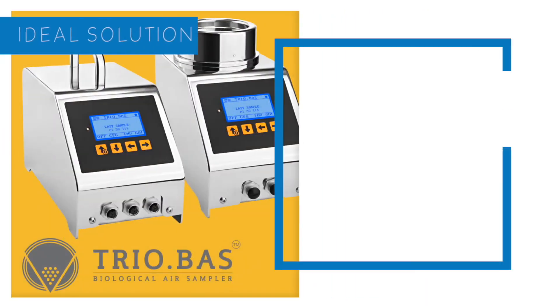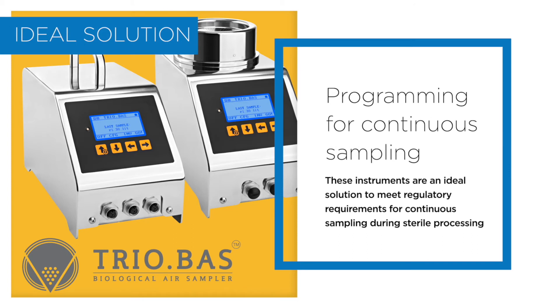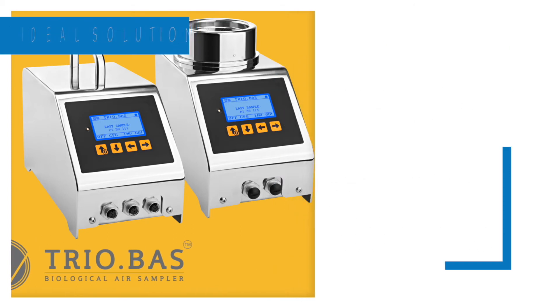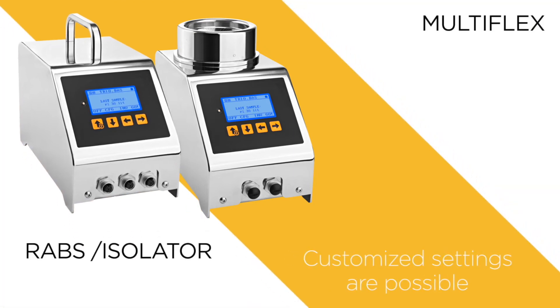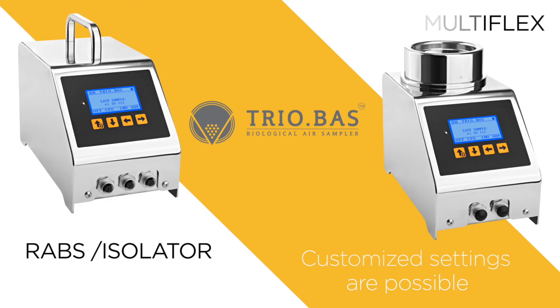These instruments are an ideal solution to meet regulatory requirements for continuous sampling during sterile processing. Customized settings are possible for both the RABS isolator and Multiflex instrument models.